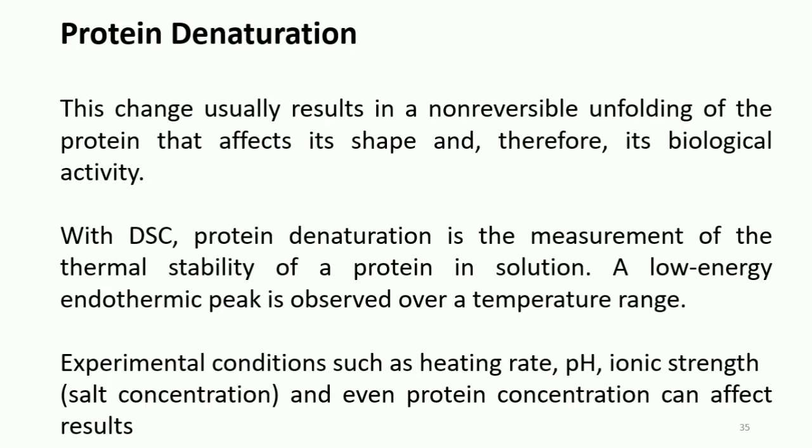With differential scanning calorimetry, protein denaturation is actually the measurement of the thermal stability of a protein in a solution. A low energy endothermic peak is observed over a temperature range.